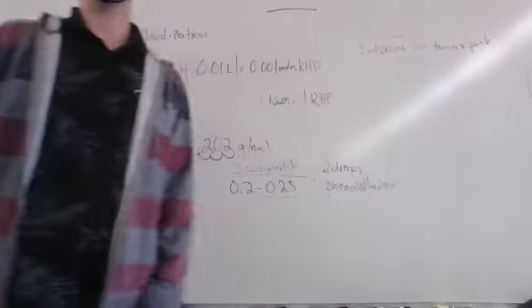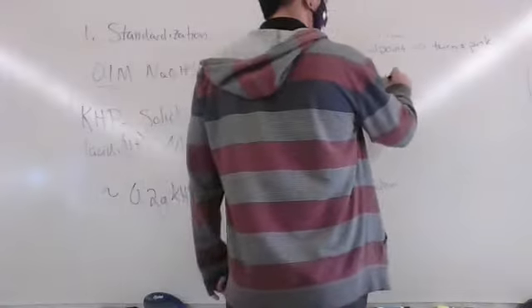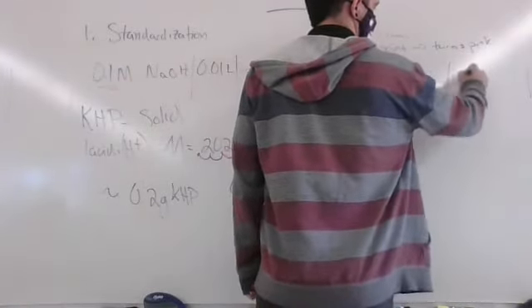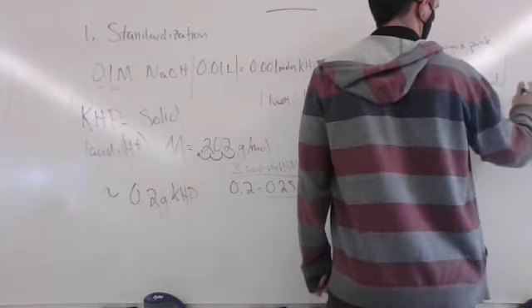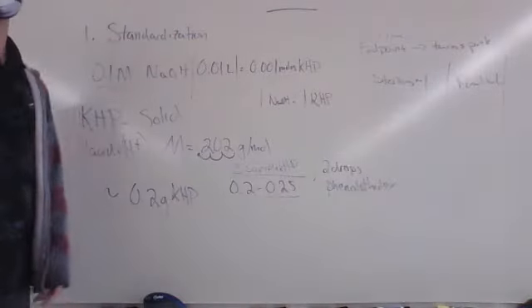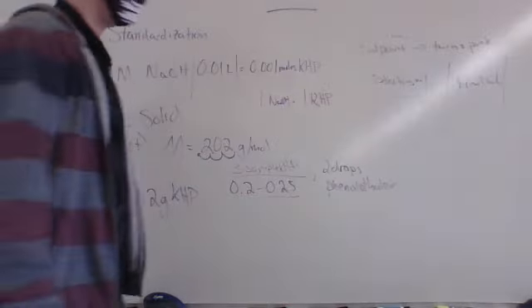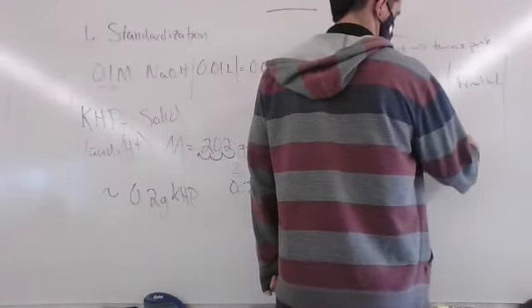Okay. Turns pink. And as you're titrating, you'll have a starting milliliters, and then a final, and then your difference will be your volume. Subtract the 2, final minus initial, and you'll get the total volume of NaOH used.